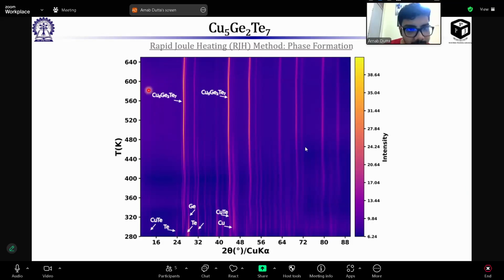But here we can see also that little phase of copper telluride still present, very weak. I was going to ask, what about the copper telluride? There is some, because I guess this is different from what you would do, right?